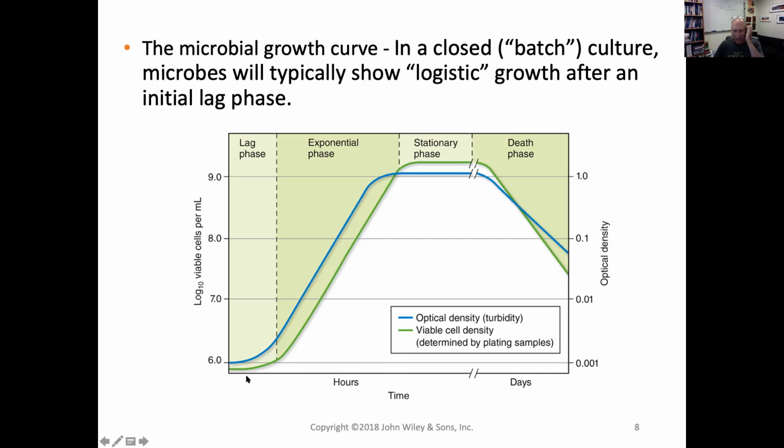Okay, now I just realized this is a little misleading because I don't want you to plot your samples the way it's shown here. In this one, it looks like a straight line because they've taken the logarithm of the value of the population density and plotted that.